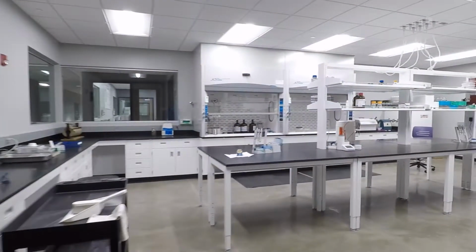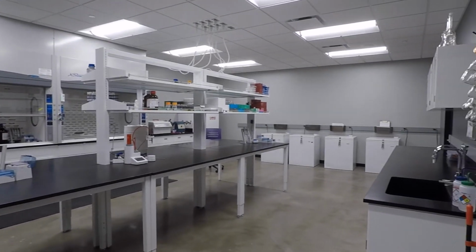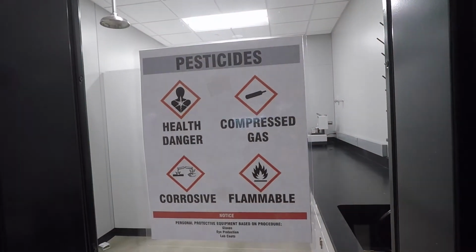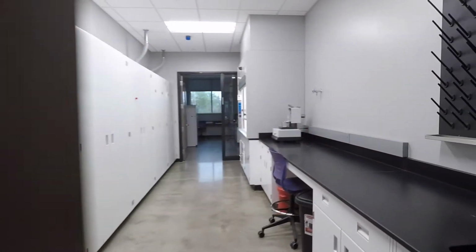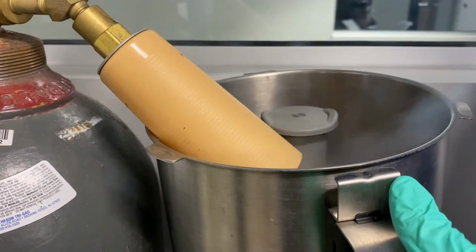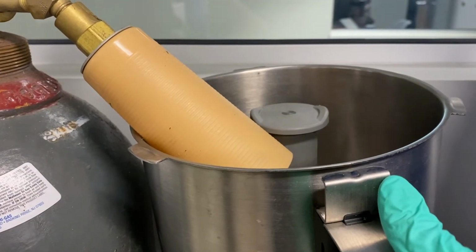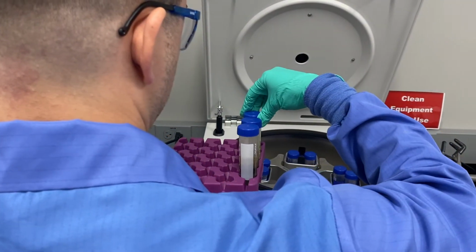The pesticide section of the KDA Lab supports the KDA pesticide program in its mission to fulfill the Federal Insecticide, Fungicide, and Rodenticide Act, which regulates the manufacture and sale of pesticide products. The majority of our pesticide testing occurs during the growing season because of the seasonal usage of pesticide products.